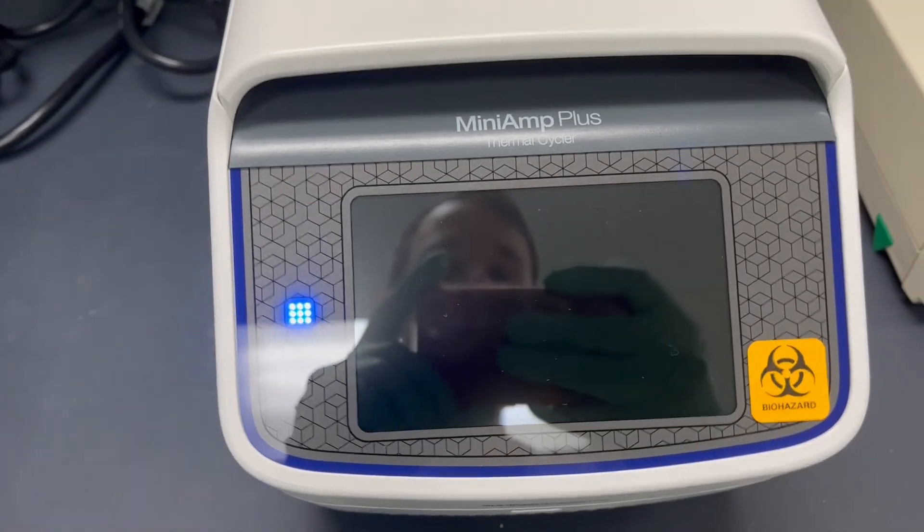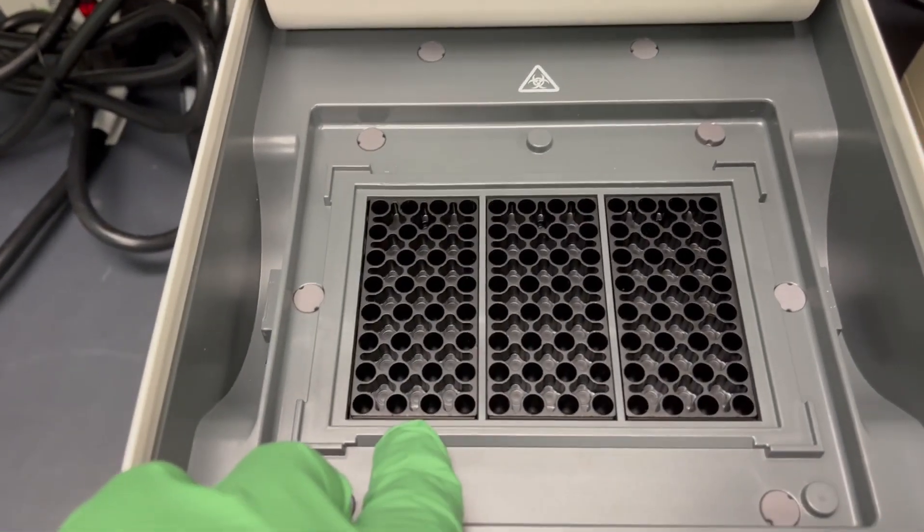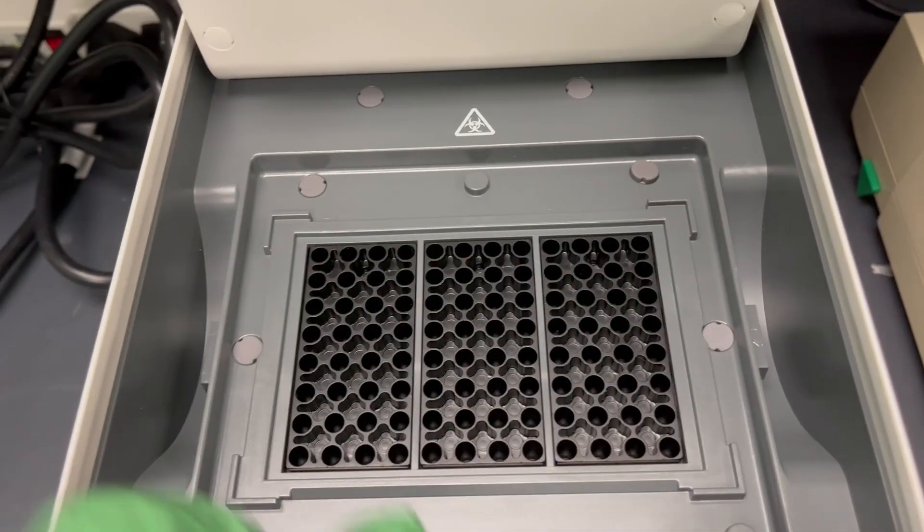Both of the power switches are in the back right, and what you can see here is that this has three separate sample blocks for a total of 96 wells.